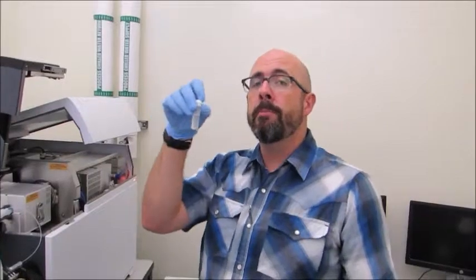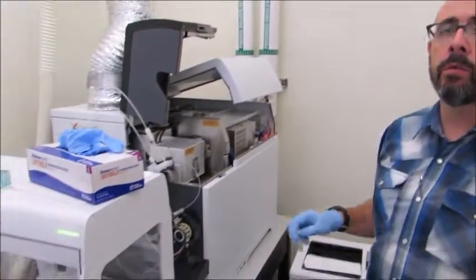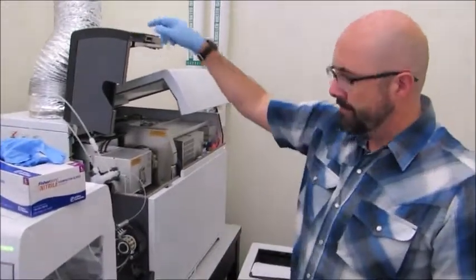The concentration of these solutions are down in the part per trillion or part per quadrillion range for uranium and thorium. Remember, a zircon crystal itself may have 1,000 parts per million. That's a tiny crystal. By the time I dilute it up into this, we're down into the part per trillion or part per quadrillion level. And we can measure that easily with very good precision on these machines.